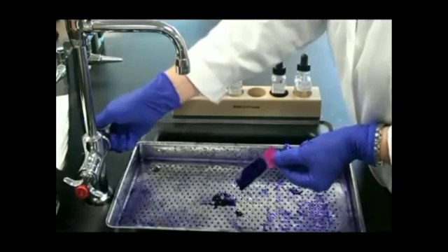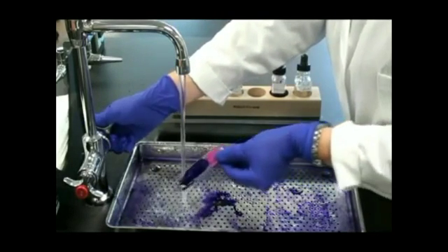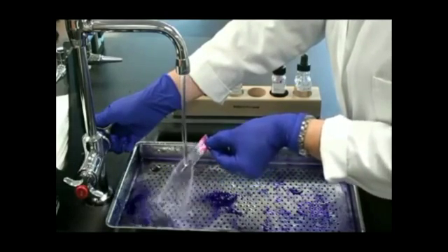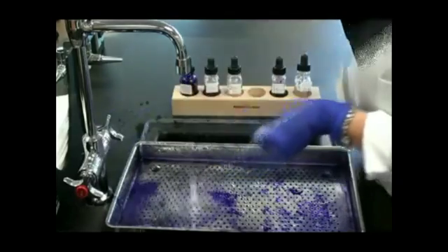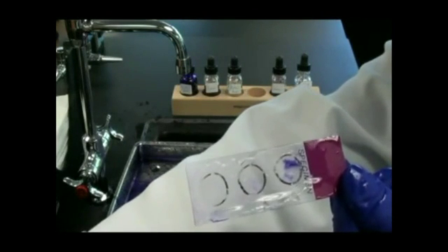Now I'm going to rinse my slide for the last time. I need to run water over it until the water coming off the slide runs clear. Here's what my slide looks like once I've completed my acid fast stain.